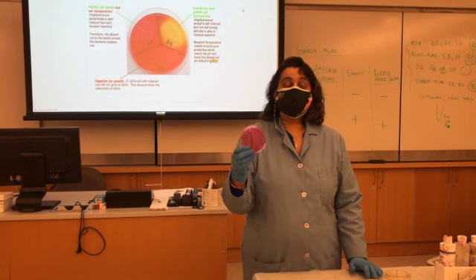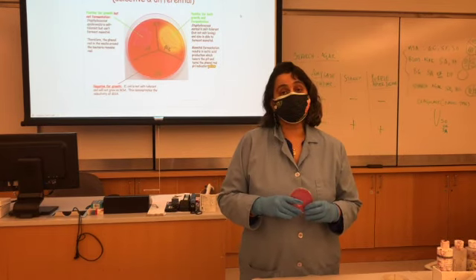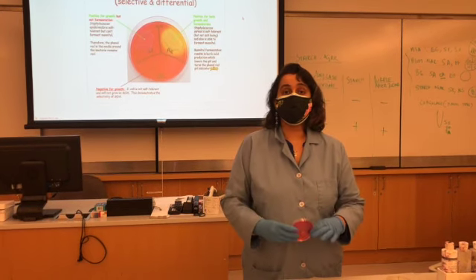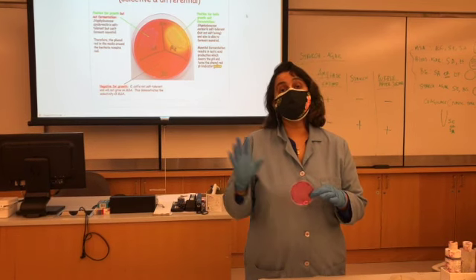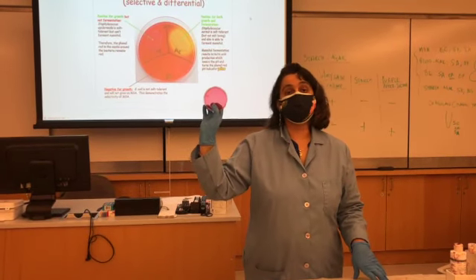Some bacteria can ferment glucose, some bacteria can only ferment lactose, some other bacterial cells can ferment glucose, lactose, and varieties of sugars. So depending on what kind of sugar you provide and whether the bacteria can break it down, you can identify the bacteria. Okay, so this mannitol salt agar, as the name says, has mannitol sugar in it.